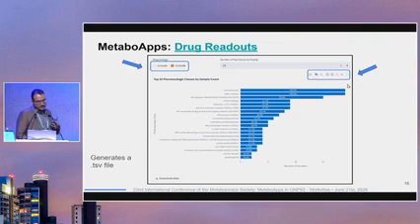You can zoom in, zoom out, and for some of those data, if you select the last icon, which is the full screen one, for some visualizations, like the Sankey plots that I'm going to show in a bit, you can also have an interactive version of them. So you can see directly on the visualization how many samples, how many compounds are based on each of those classes. And at the end, you can also download the data, which is going to provide you a table of exactly what's been calculated for this bar chart.